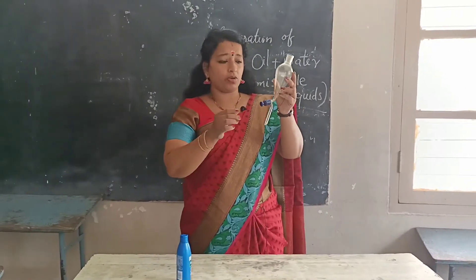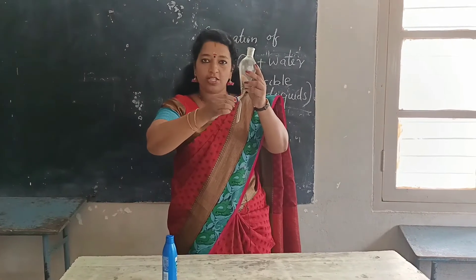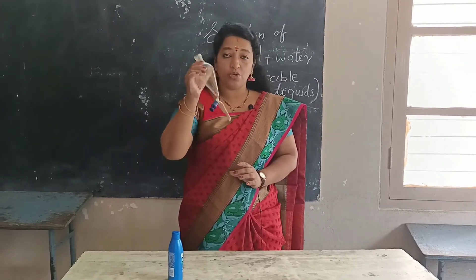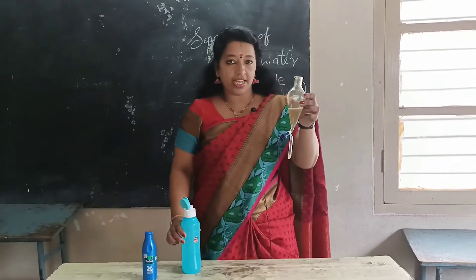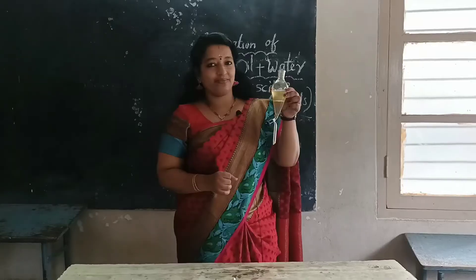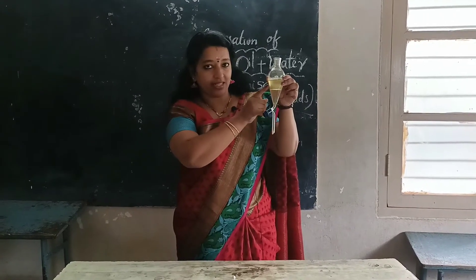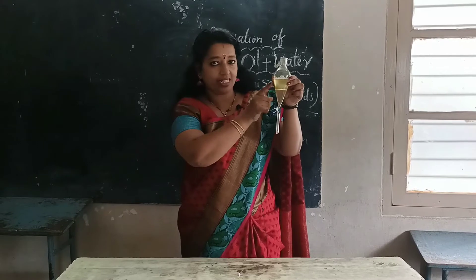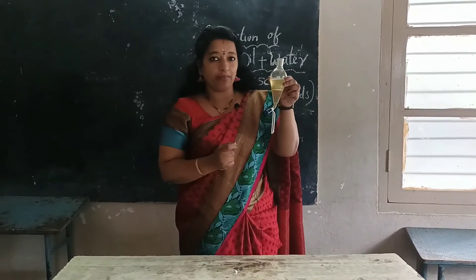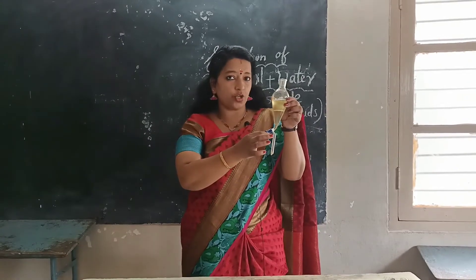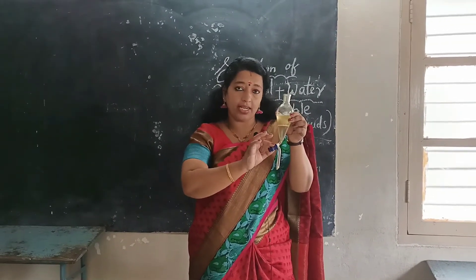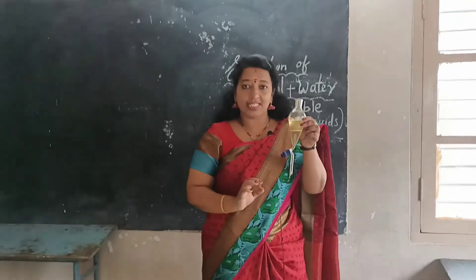Here there is a small part called a stopcock. We can open it or we can close it. I will show you how to separate oil and water now through the separating funnel. I have taken some amount of oil in the separating funnel and I am going to pour some water. When I pour the water, you can see two different layers — water and oil layers separately. Water is at the bottom and the above layer is oil. Using this stopcock we can separate oil and water.